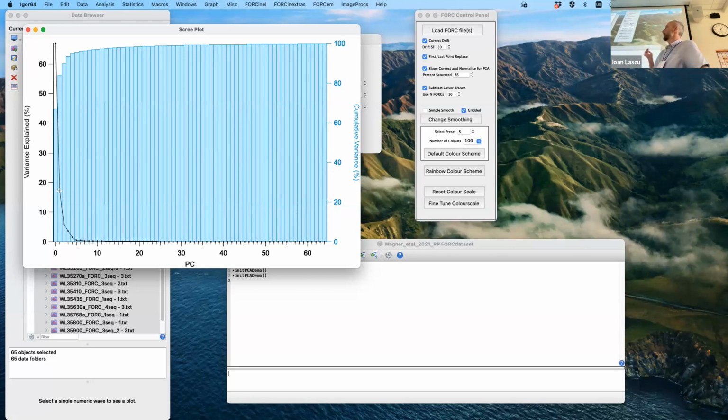So we're going to go in this case with the first two principal components. If there's time at the end, I can show you what happens if you just choose the first principal component. If you consider that the third principal component also explains a significant amount of the variability, then you can do that, and then you're operating in 3D space. So you'll have 4 end members that it's a little bit harder to visualize and actually move around and explore the unmixing space, but it can be done.